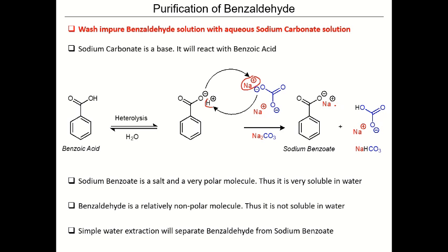Then what we're going to have is this salt, which is named sodium benzoate, and this other salt, which is sodium bicarbonate, right? And sodium benzoate, as you can see here in this statement, is a salt and it's a very polar molecule because it's a salt, with a very high dipole moment.